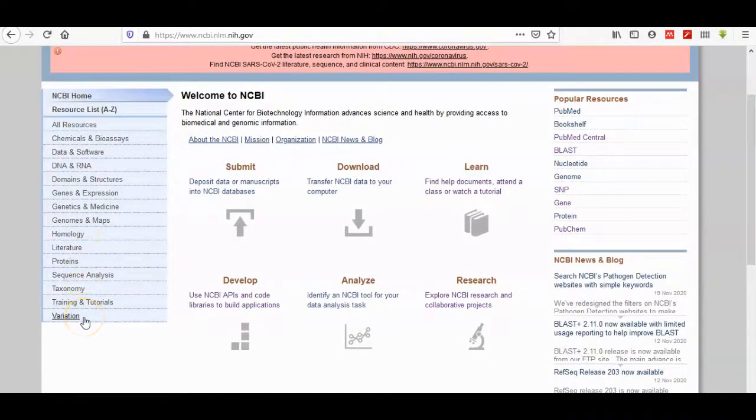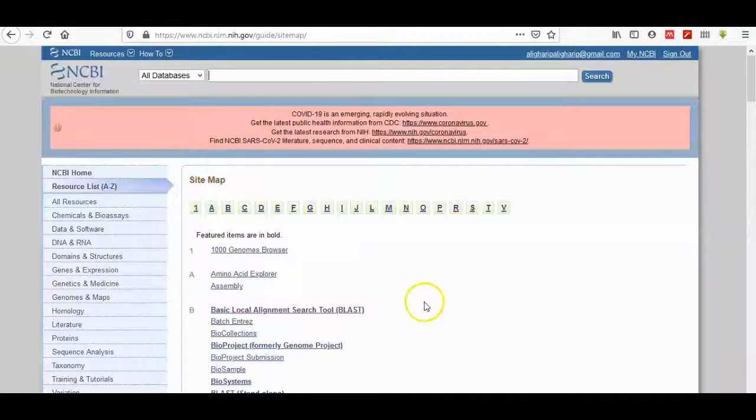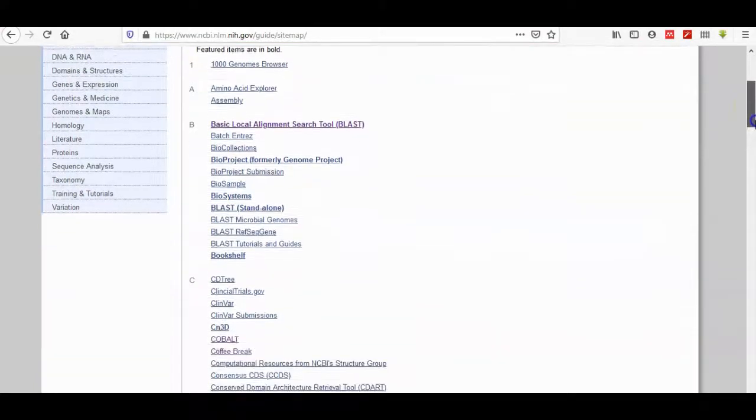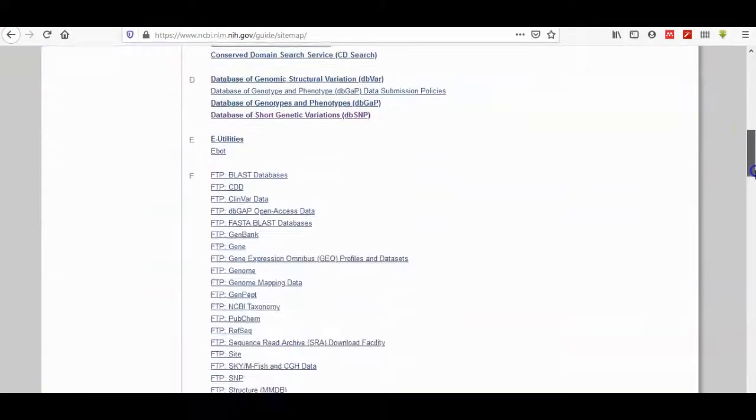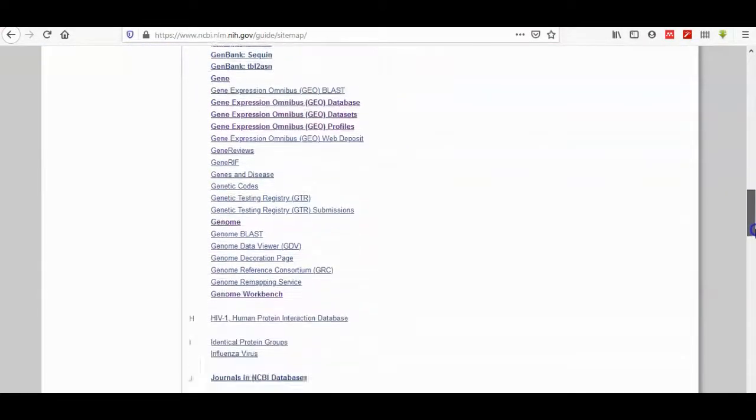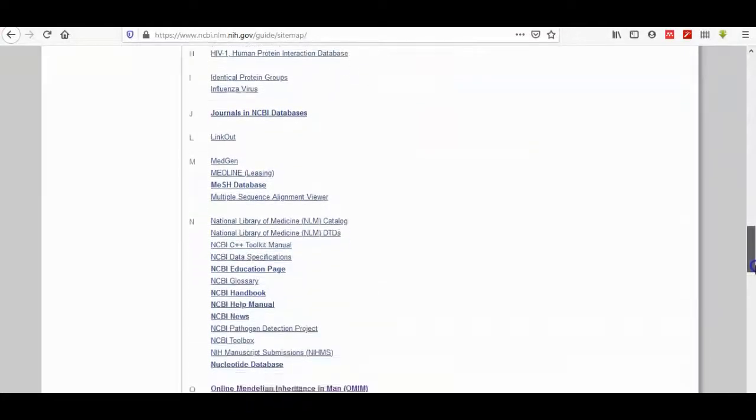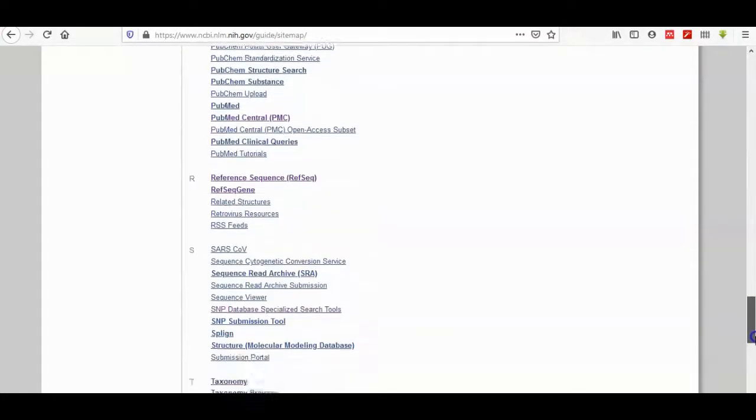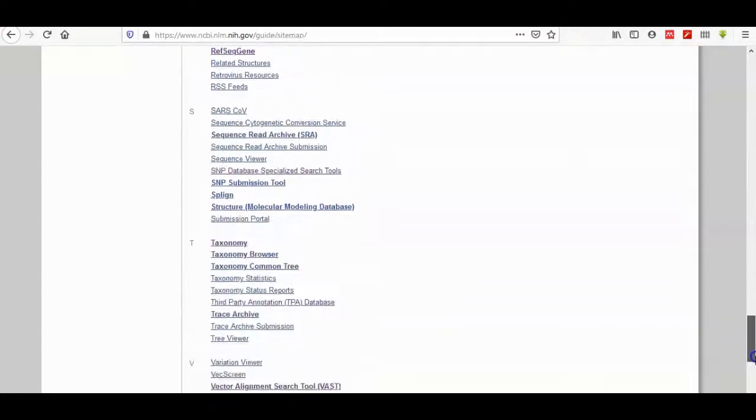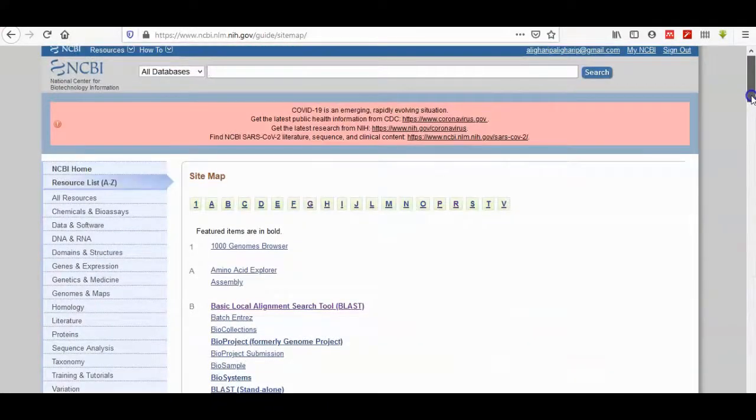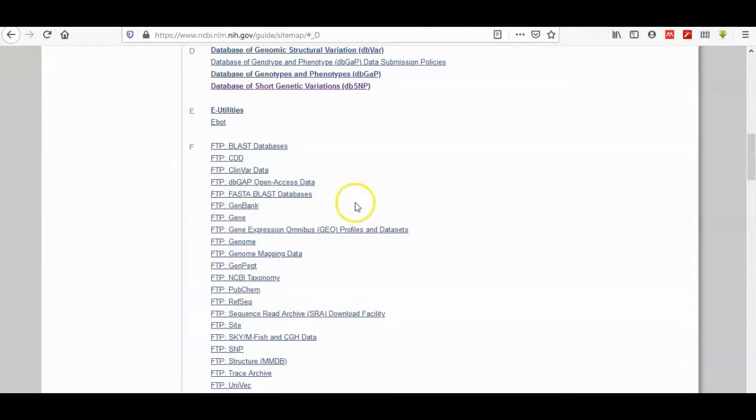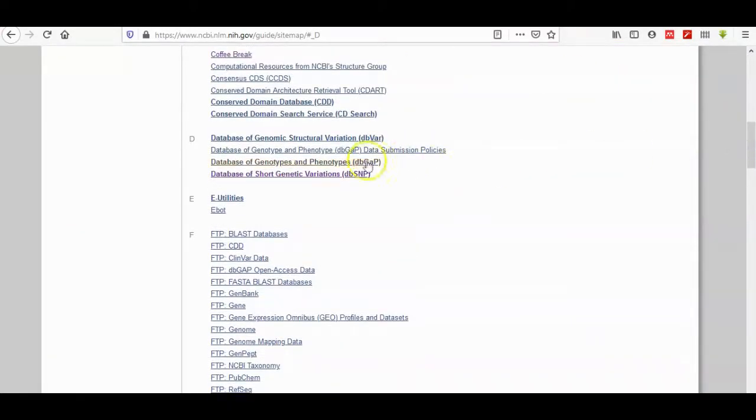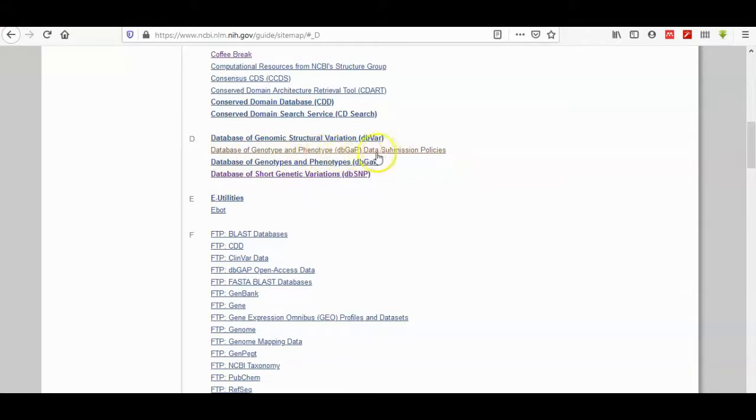If there is no choice, then we have to go to resource list A to Z. From here we can search for the database of SNPs, database of genotype and phenotypes, database of genotype and phenotypes, data submission policies, structural variation. We have to go to database of short genetic variation.